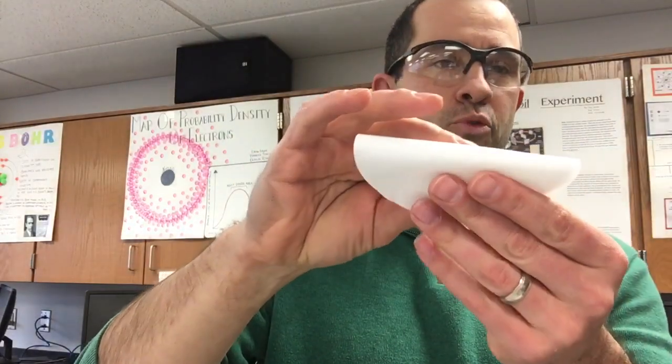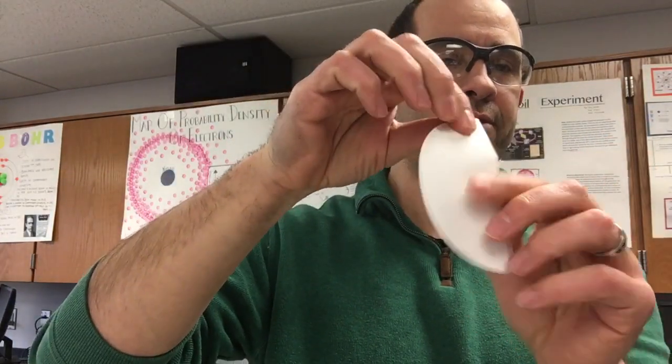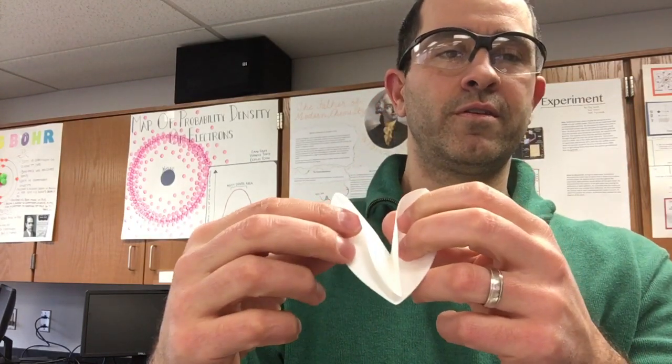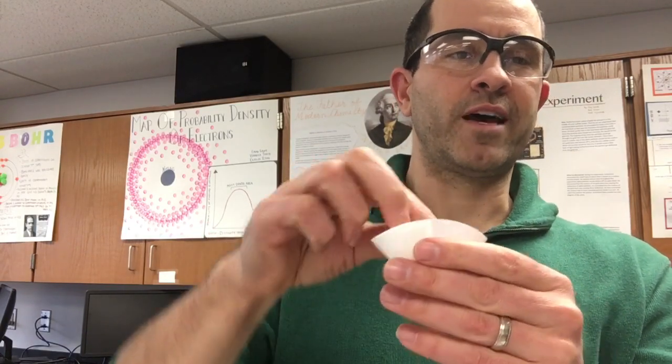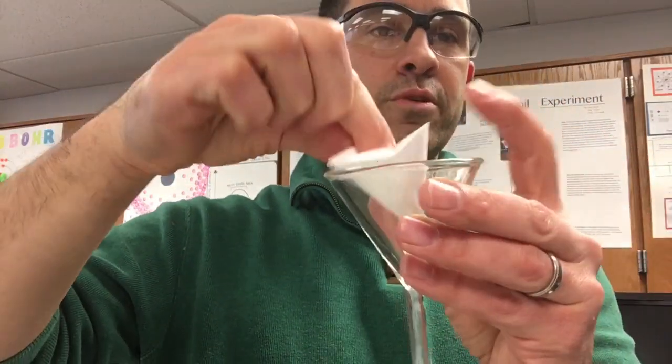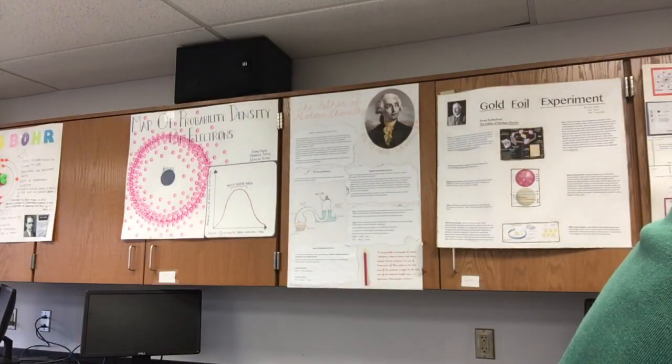So what we need is a piece of filter paper. The way you fold a piece of filter paper is we fold it in half and then fold it in half again, so it looks like a little snow cone. If you look, there are four pieces of paper, so we pull three pieces to one side and one piece to the other side — a little snow cone. We put that into our glass funnel, and we need it to stick to the side, so we wet it. I ran it under a little bit of water and now it's damp and ready to go.